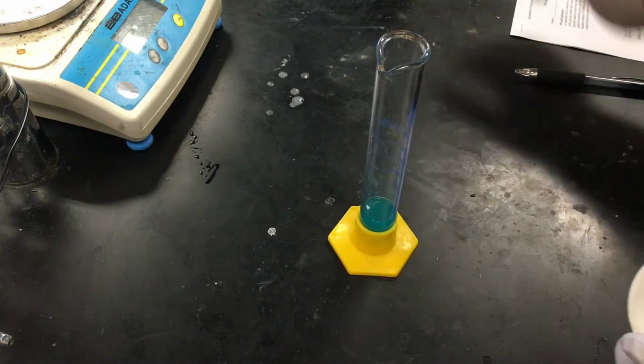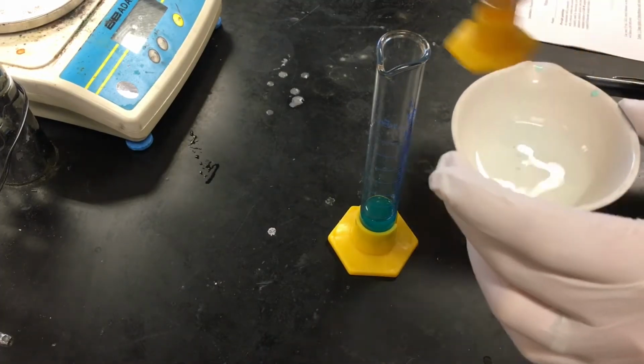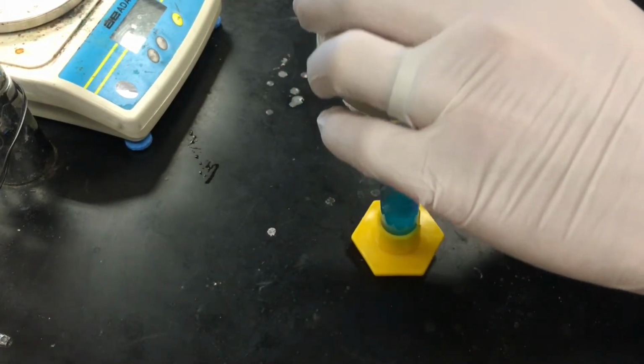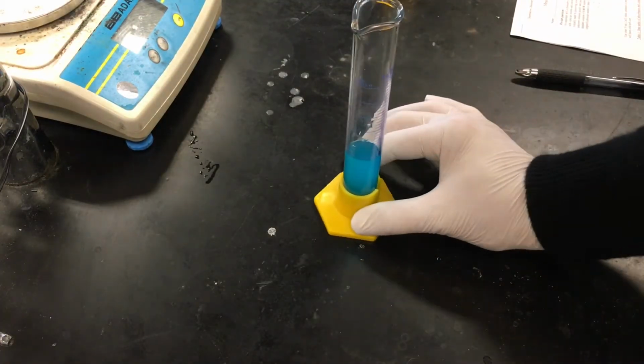We're going to rinse this with some more water, always making sure that we stay under 35. Okay.